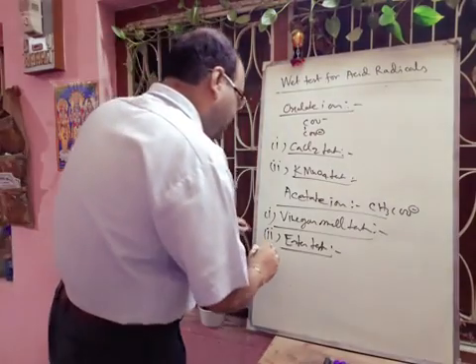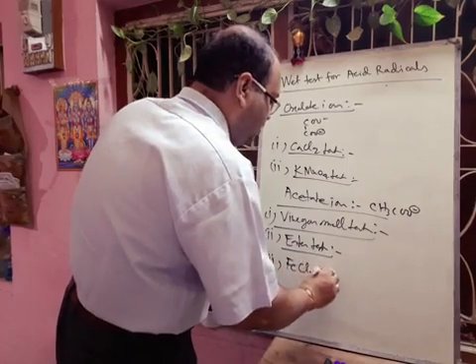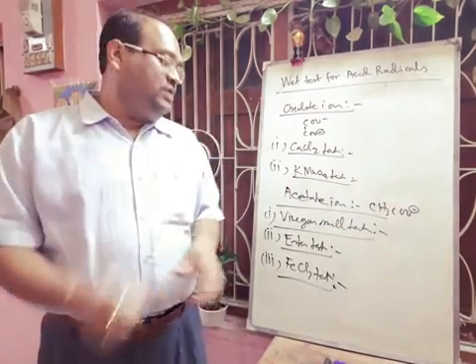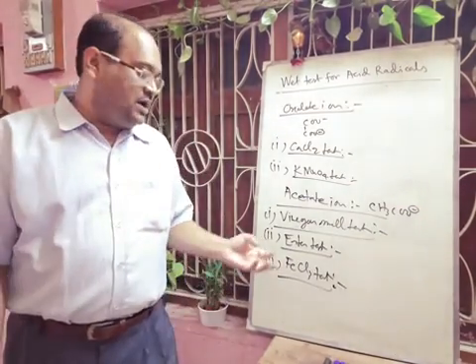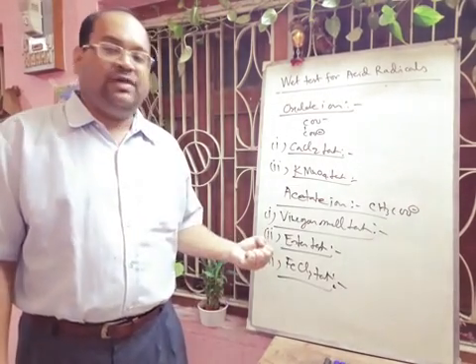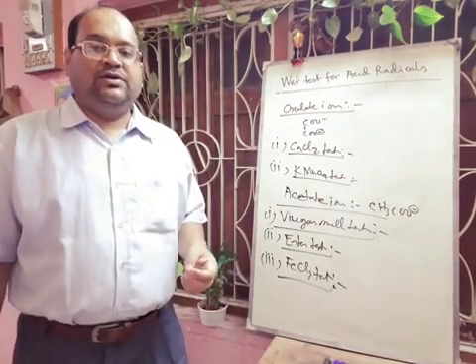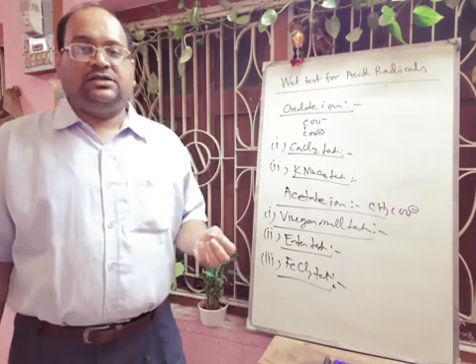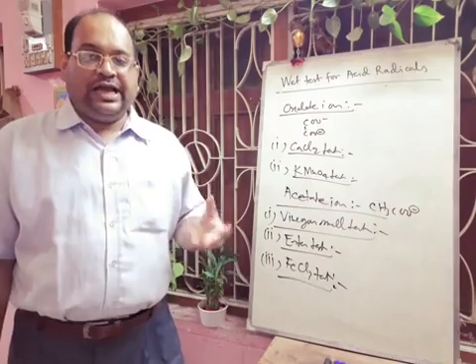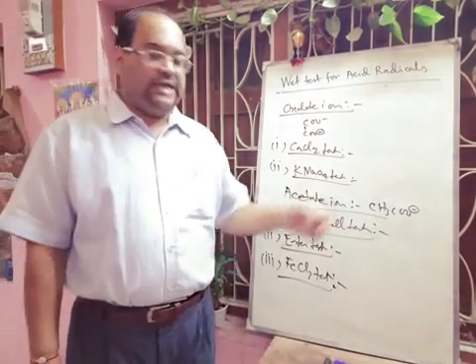Another test we can do is the ferric chloride test. For this we prepare a neutral ferric chloride solution. We take 1 ml of the water extract and add a few drops of neutral ferric chloride solution. First you will get a red colored solution, which on dilution and boiling gives a brown colored precipitate. In this way also you can confirm the acetate ion.